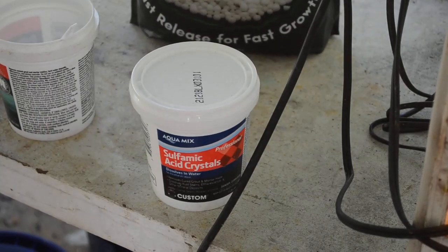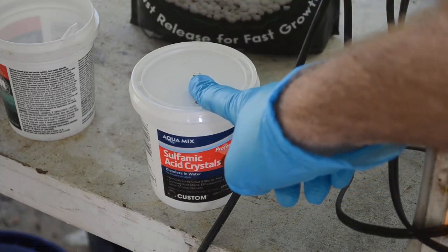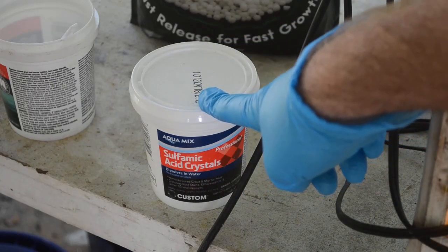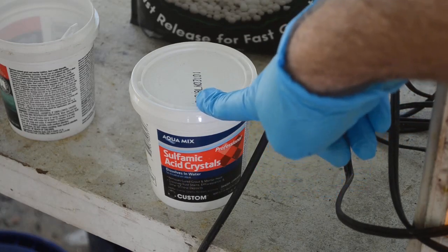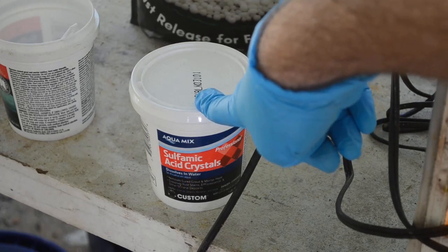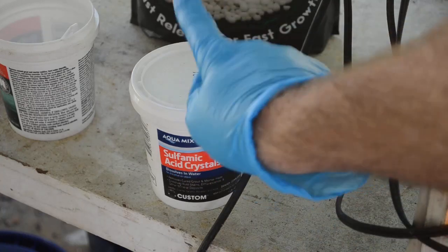Sulfamic acid — S-U-L-F-A-M-I-C — sulfamic acid is what you want. It's used for lots of things, but mainly you'll find it sold as a grout cleaner for tile. I can buy it at Home Depot; it's fairly cheap. Sulfamic acid actually destroys the nitrate ion — it reacts with the nitric acid in solution and converts it to sulfuric acid. That's where some confusion comes in: people think it's the conversion to sulfuric acid causing the denoxing. It does destroy the nitric acid on the way to making sulfuric acid, but you can't just add sulfuric acid and get the same effect. You have to use sulfamic acid.